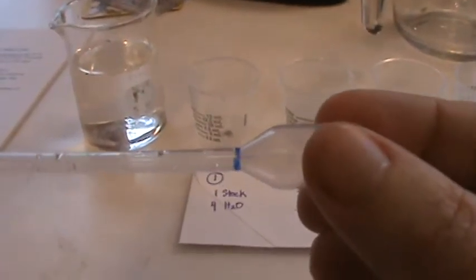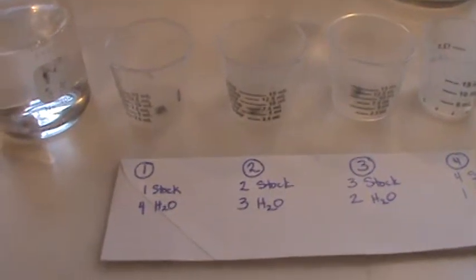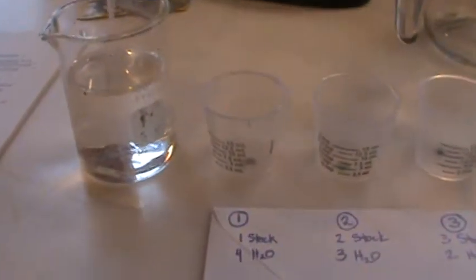Now, I have what's here called a disposable pipette, and I have marked the 1 milliliter line upon it here. Okay, and so now what I'm going to do is I'm going to start with the water. You can see that I need 4 mils, 3 mils, 2 mils, and 1 milliliter of water in there.